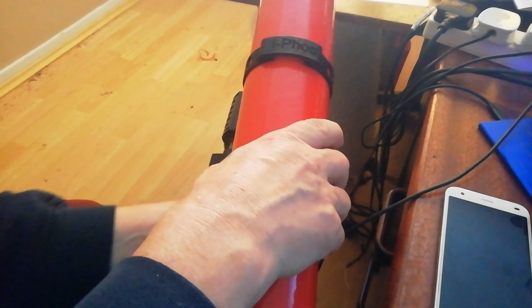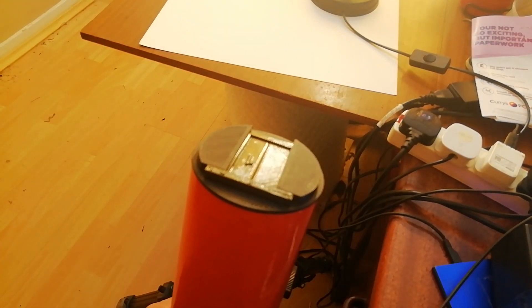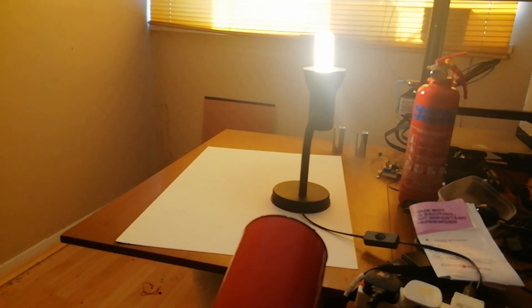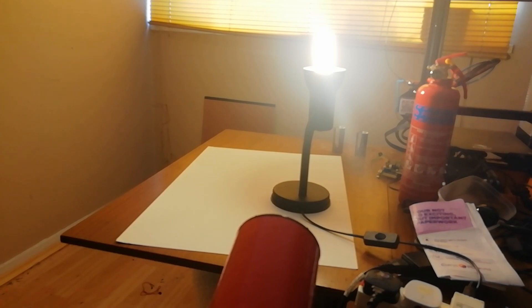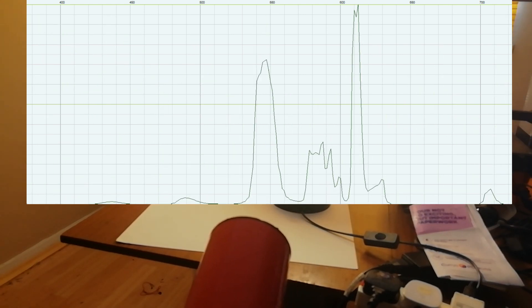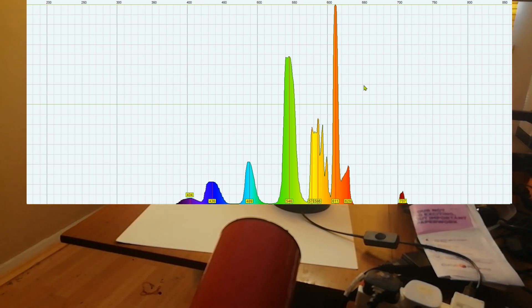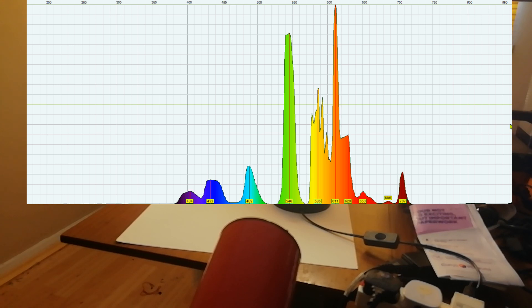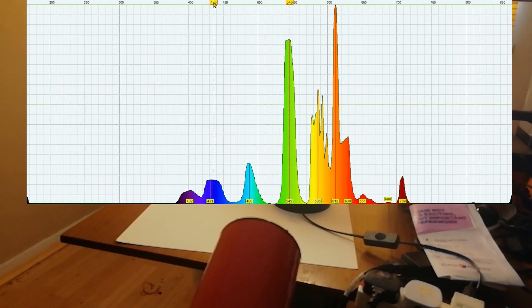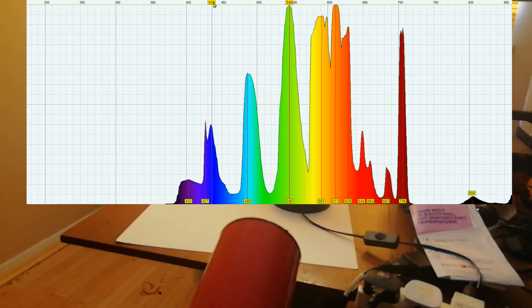Before every session with the IFOS, you should recalibrate it to make sure it's reading accurately. That's done with a standard compact fluorescent light bulb. I need to fit the 1mm slit plate for that. Just align it with a light source using the spectrometer's display, then play with the exposure settings on the software to get a good exposure so that nothing's saturated or in the noise floor. These compact fluorescent lamps, or CFLs, are a good choice for a calibration source because they've got lots of spiky features. Although they vary from manufacturer to manufacturer, two mercury lines — at 436 in the blue and 546 in the green — are always exactly the same. Those are what we use to calibrate.